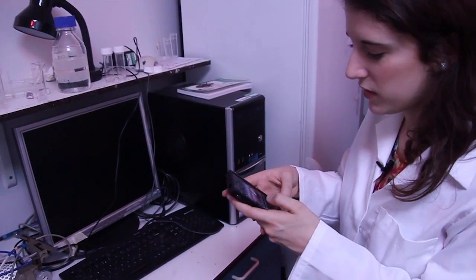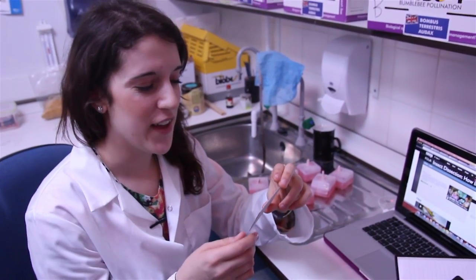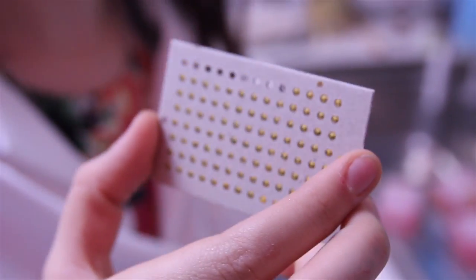So that's three minutes. The numbers are literally just a name for the bees. I mean I could give them all names but it would be quite hard to keep track of them all. So this bee is going to be yellow number 10.